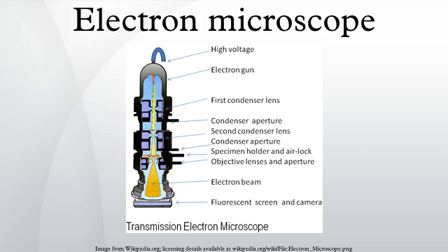Microscopes designed to achieve high resolutions must be housed in stable buildings with special services such as magnetic field cancelling systems. The samples largely have to be viewed in vacuum, as the molecules that make up air would scatter the electrons. One exception is the environmental scanning electron microscope, which allows hydrated samples to be viewed in a low-pressure and/or wet environment. Scanning electron microscopes operating in conventional high-vacuum mode usually image conductive specimens.